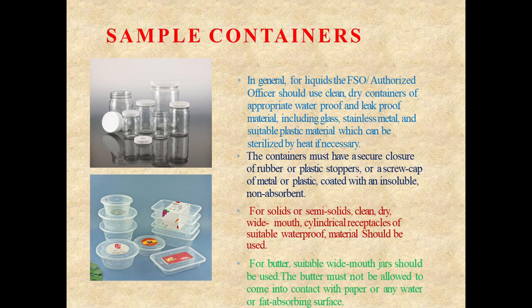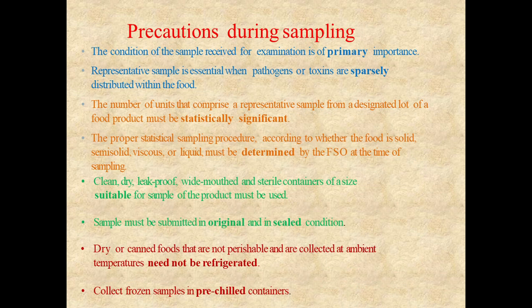For solid or semi-solid, clean, dry, wide-mouth cylindrical receptacles of suitable waterproof material should be used. For butter, suitable wide-mouth jars should be used. The butter must not be allowed to come into contact with paper or any water or fat absorbing surface. And this is precaution during sampling.